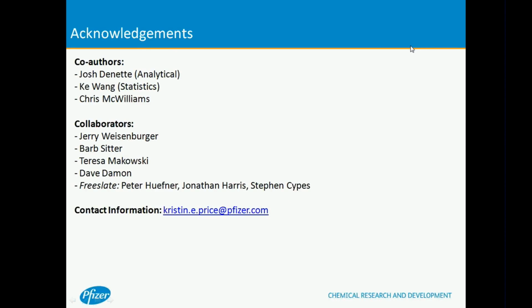Typically, the larger scale screens, where we're running hundreds and hundreds of vials, tend to happen after a few batches have been run on sort of kilo lab or pilot plant scale. So early development has happened, and there is a scaled method in place, but potentially we usually are evaluating options to change that for future scale-ups.